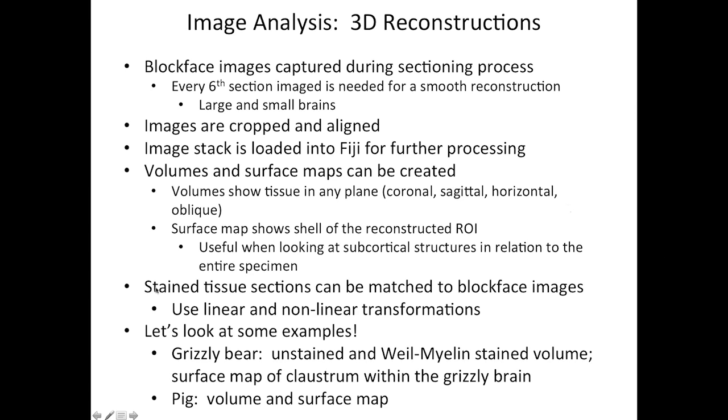So let's look at some examples. We have a grizzly bear reconstruction as well as a pig brain reconstruction that we've been working with recently. And I am very excited to show you guys. So we'll start off with the grizzly bear brain, and I've already loaded these into Fiji, done the processing.